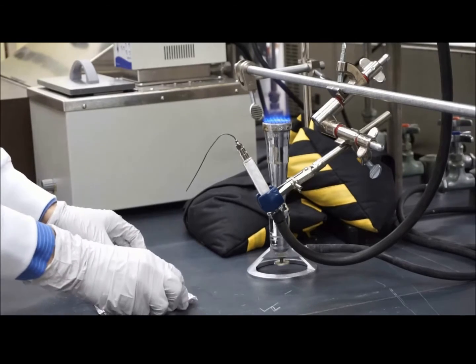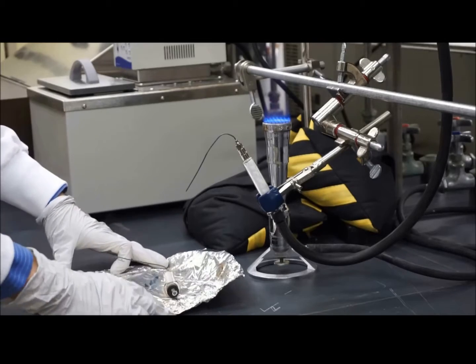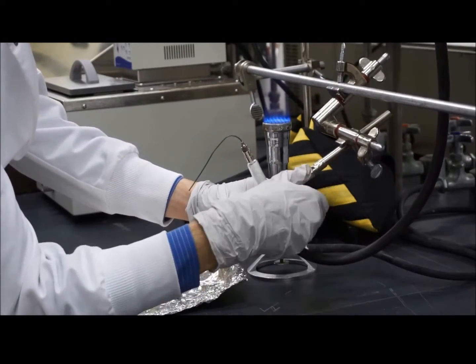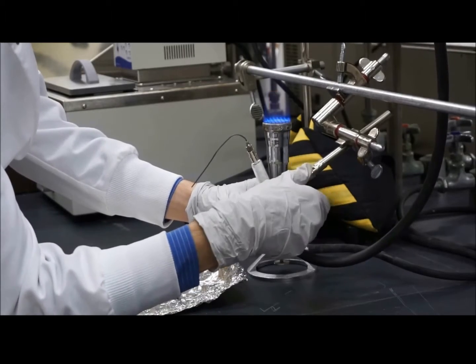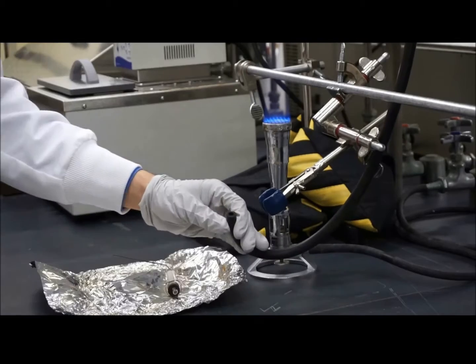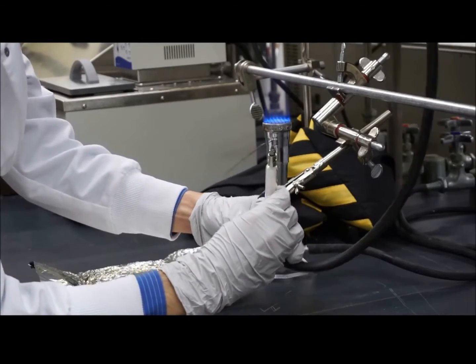We retrieve a new gassing probe that has been autoclaved in aluminum foil in order to sterilize it. We remove the old gassing probe, which is no longer sterile. We exchange it with the new, sterile one.